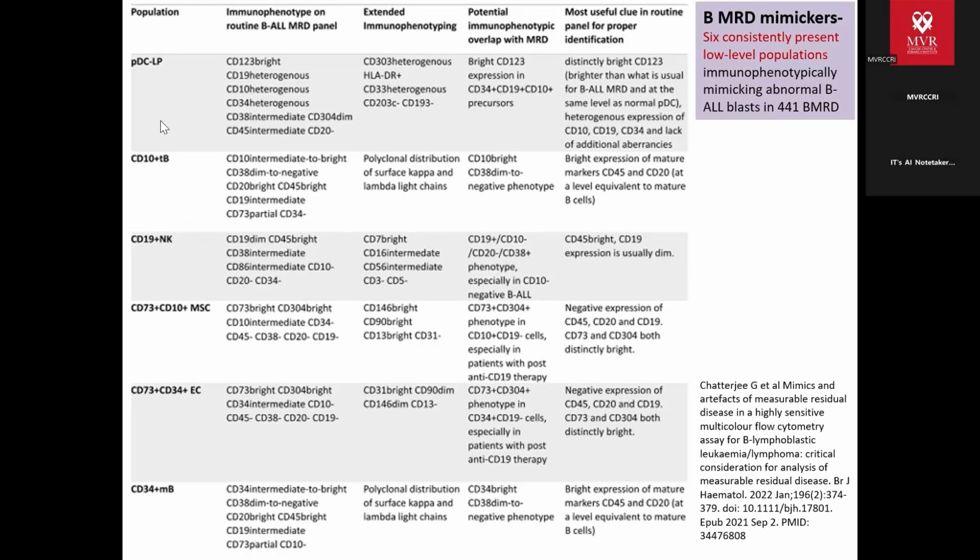Then hypocellular sample. The problem with a hypocellular sample is that we will not be able to analyze a sufficient number of cells. I told you that for diagnostic purposes, we need to analyze at least 1 lakh events, that is, the number of cells. Whereas in MRD cases, we analyze cells in millions, that is 2 million, 4 million. In our institute, we are aiming to analyze 4 million. But sometimes, even if I've said that I'm going to analyze 4 million, just because the sample is hypocellular following induction therapy, the marrow may be going into aplasia, with hardly any number of cells there.